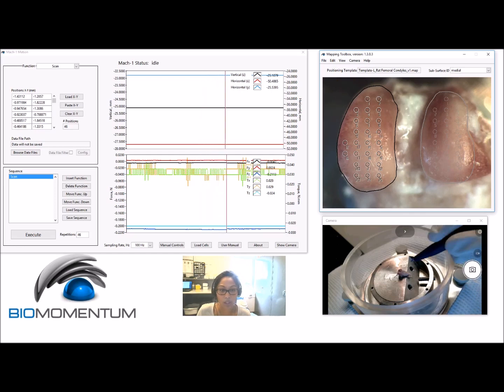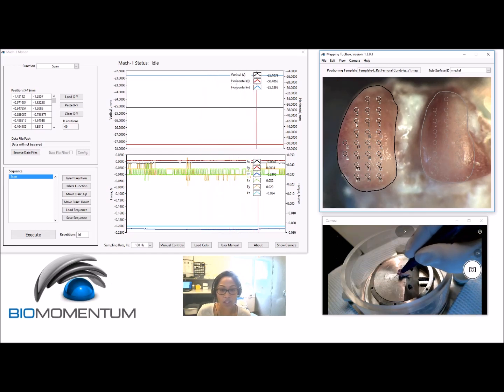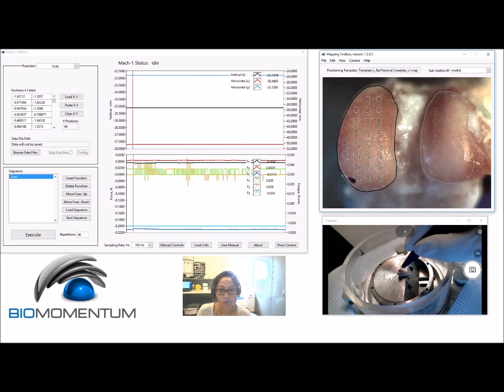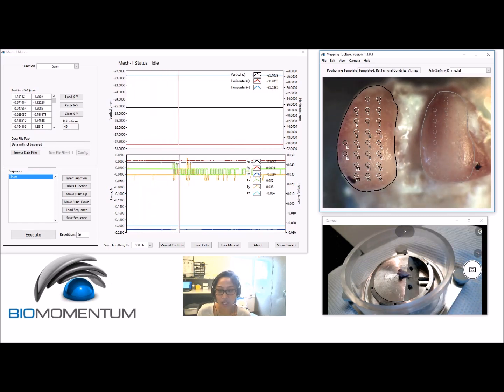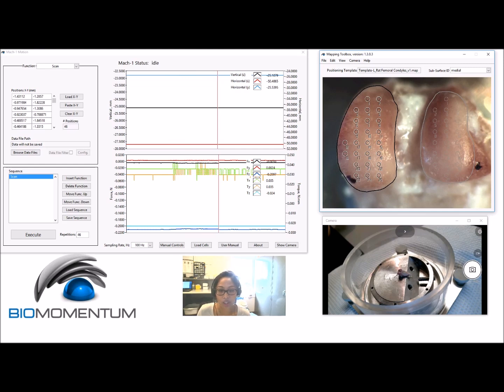In order to dimension the sample and calibrate its image, two reference marks need to be created on the sample surface as far as possible from each other, ideally not over regions of interest. Marks should be made at approximately the same surface height, ideally at the average horizontal mapping plane, since it is the top view image of the sample that is calibrated.